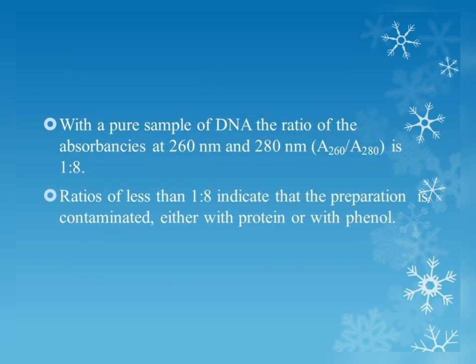With a pure sample of DNA, the ratio of absorbance at 260 nanometers and 280 nanometers is 1.8. A ratio of less than 1.8 indicates the preparation is contaminated, either with protein or with phenol.